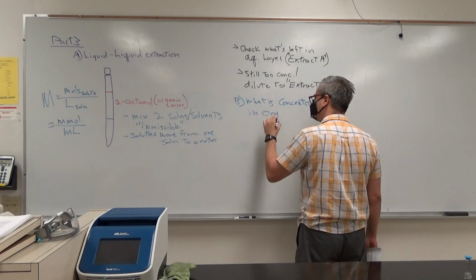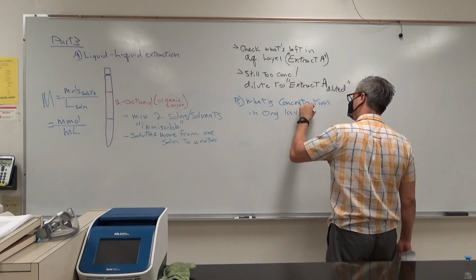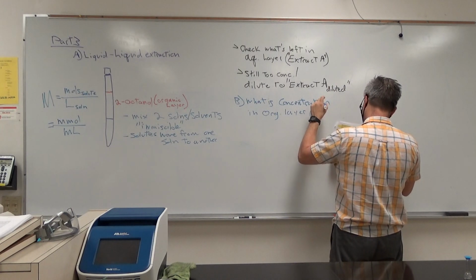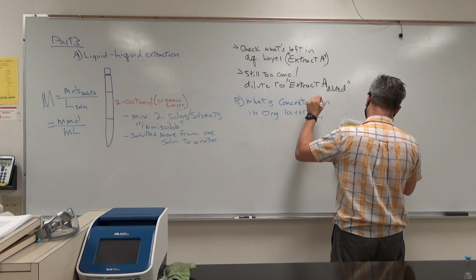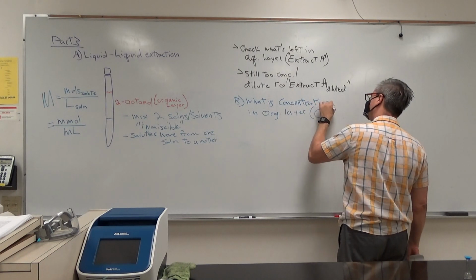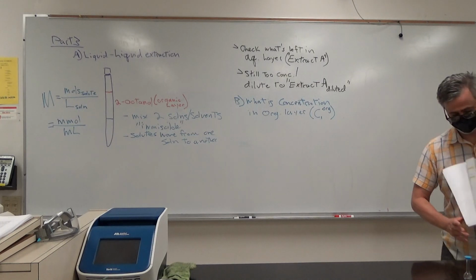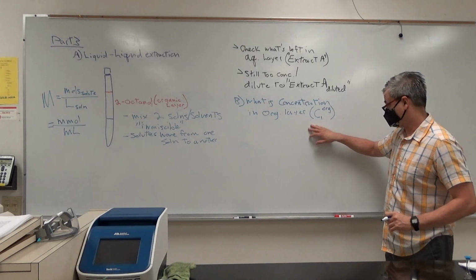That may seem like, well, you said that we can't put it in the machine. Okay. This is going to be C superscript. Yeah, superscript, gosh. He liked his symbolism. Okay. So we want to know what the concentration is in the organic layer.